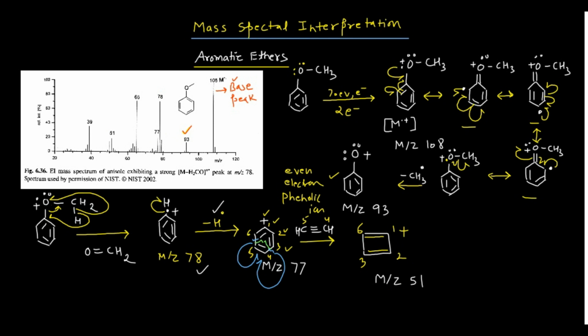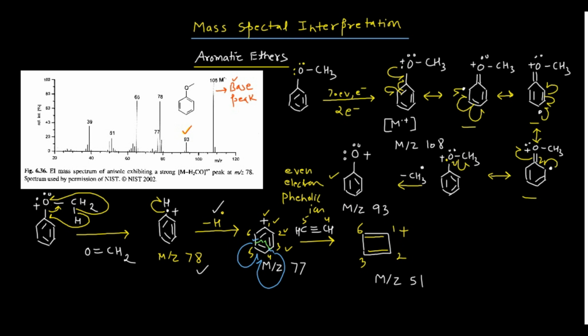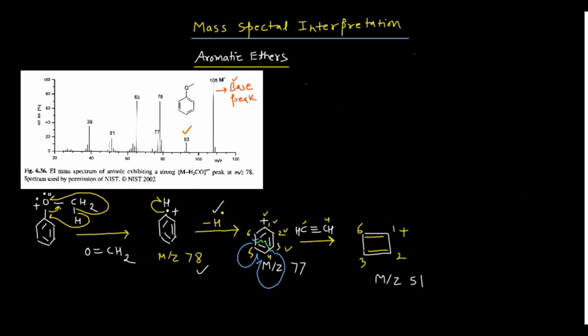Now let's talk about this ion 65 and your 39, right? So for this I need some space. So for this actually I am taking one of my earlier structures. If you have noted down this thing, I was having this particular structure. I'll use this one for the fragmentation pattern, or any of the structures I can use for this one. So here in that case, I'll draw the structure.